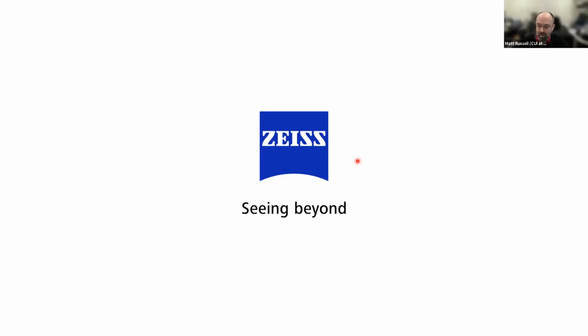Yeah, hi, Philip. I have a question, and apologies if this is something that you've already been through, but what kind of level of technology in terms of X-ray microscopy do you need to do the kind of things that you're talking about? Because I know that if you have an X-Radia, then that's ideal, of course.